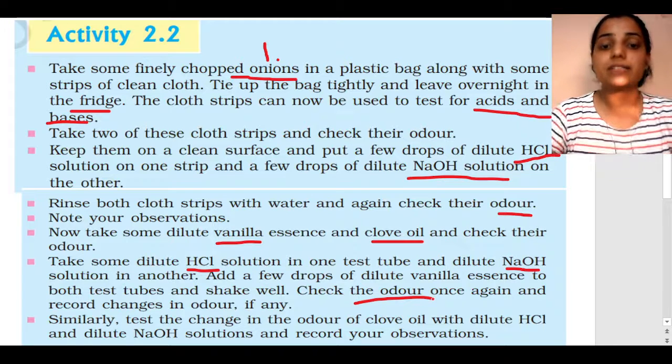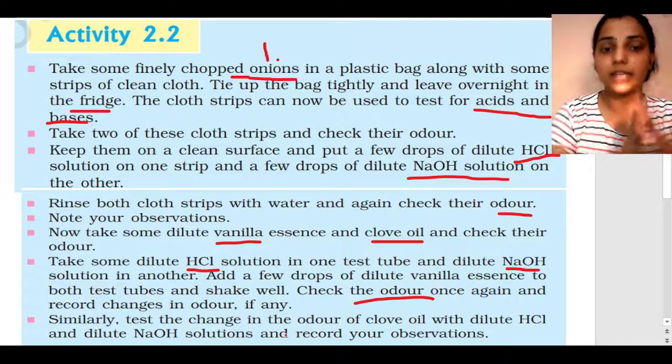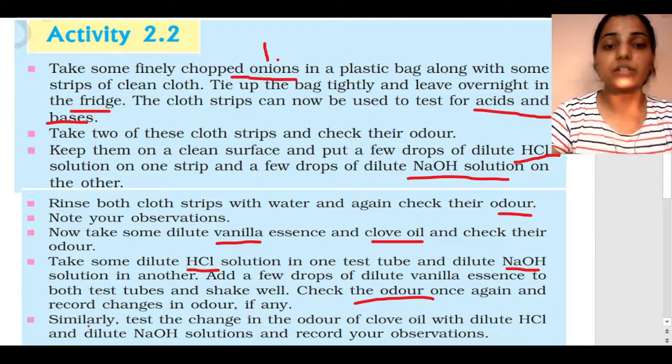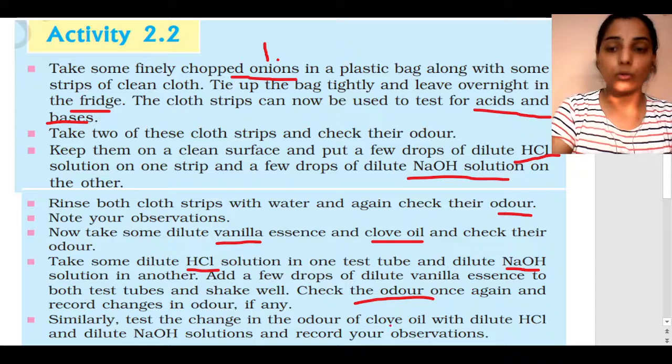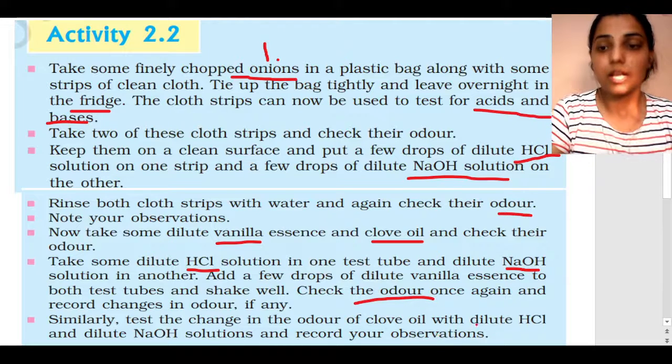अब similarly test the change. अब हमें क्या करना है, like we have just first we have done that. Now we have to test the change in the odor of the clove oil with the dilute HCl and NaOH solution. Record your observation, isn't it?